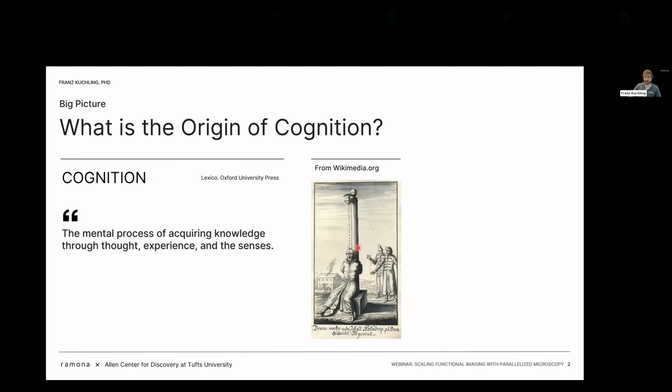And the reason this is so torturous is because those droplets don't just come at a very paced stream, but they almost drop in randomized intervals because there's so much noise in the system.